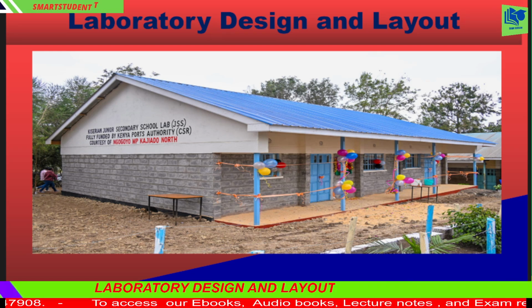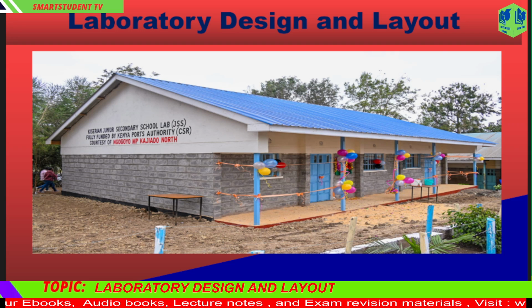In today's tutorial, we dive into a vital yet often overlooked topic: laboratory design and layout. A well-designed laboratory is the backbone of efficient scientific research and safe learning environments. The layout and design of a lab not only influence productivity but also play a crucial role in ensuring safety, functionality, and compliance with regulations. This chapter will focus on understanding the key principles of laboratory design, the factors to consider when planning a lab layout, and how a thoughtfully designed lab can enhance workflow while minimizing risks. Let's explore how to create laboratories that inspire innovation and ensure safety.